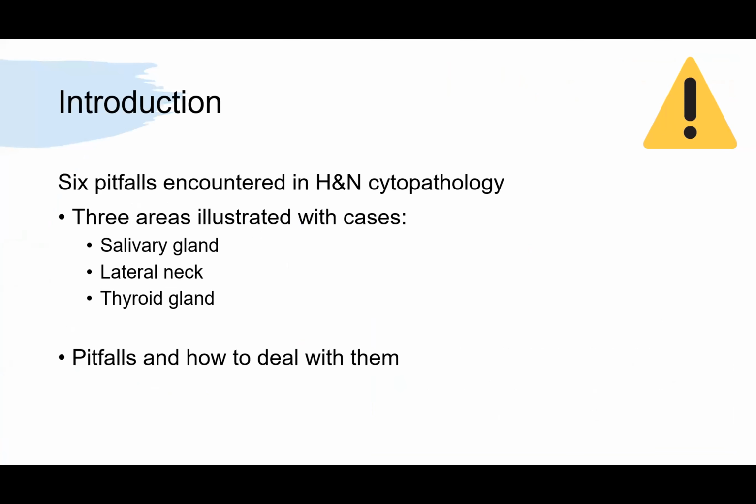I'm sure you'll all agree that there are numerous pitfalls when we talk about head and neck cytology. What I'm going to do in the next 30 minutes is focus on 6 pitfalls which have been encountered in regular practice and illustrate these with interesting cases. Hopefully they'll be very educational. Some of them are common and they are challenging. So I will look at the various cytopathology associated with the pitfalls and potential ways to deal with them.